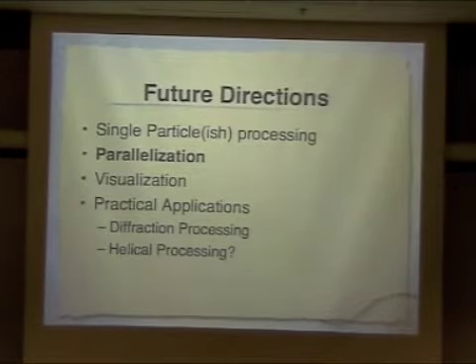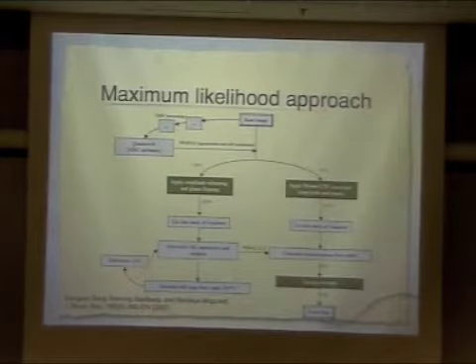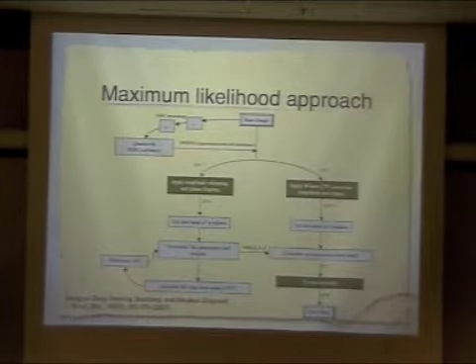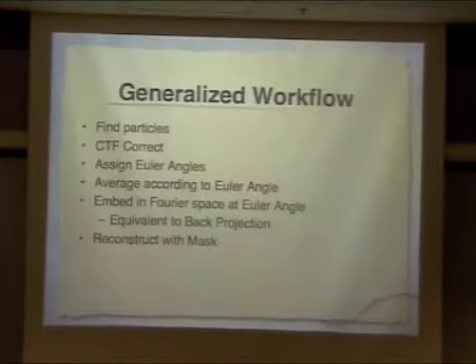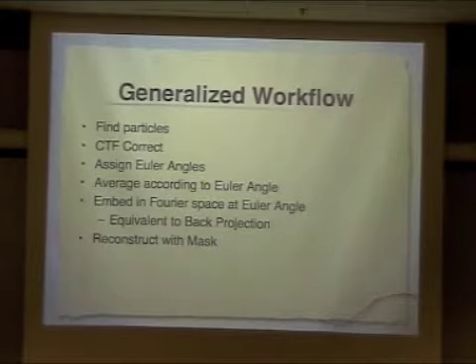I'm free to discuss afterwards a bit more about the philosophy, but I really encourage people to think about that. Ben was asking me if we're looking at local rotations and rotationally unbending an image and so forth. I would submit that a rotational unbend is really just another flavor of a single particle-like process or procedure that you can do on crystallographic data. And I would like to see that much more. I think there are continuous transformations that aren't necessarily Fourier, promising among them the fractional Fourier or wavelets or so on, that can do similar aspects in this workflow, that can pick up the slack for poorly ordered crystals.